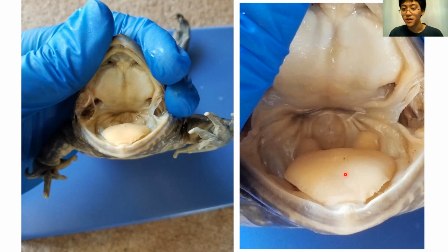So besides jumping, the other main adaptation they have for catching prey is this tongue, which oddly enough is attached to the frontal portion of the mouth, the more anterior portion. And it's sticky on the posterior portion. So when they land, they can flip it out and curl it back in, and it'll act as a little fly trap to capture prey.